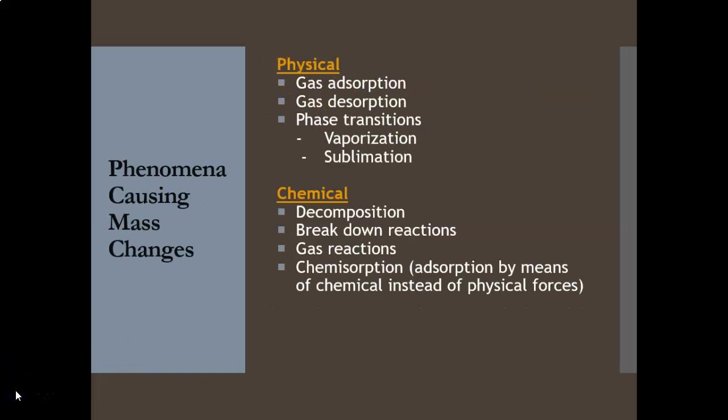If the material that you want to test increases in weight at the end of the testing, it is normal because of the initial oxidation of the material through interaction with the oxygen from the atmosphere.